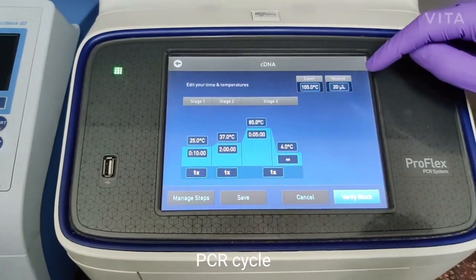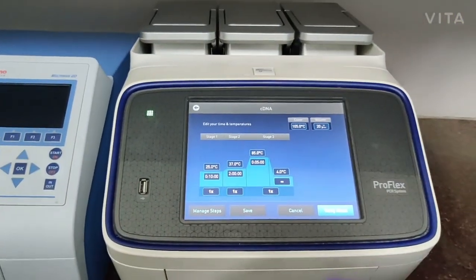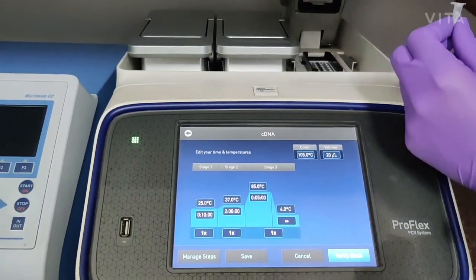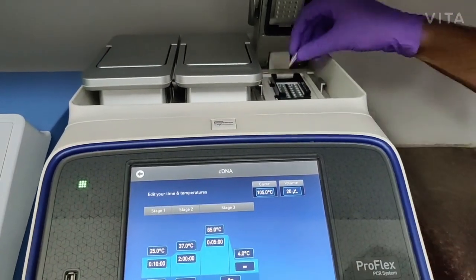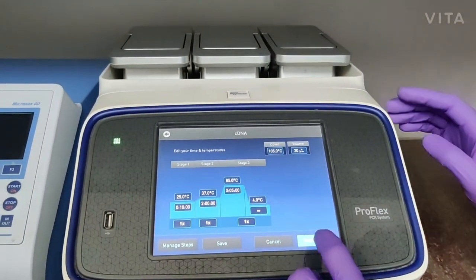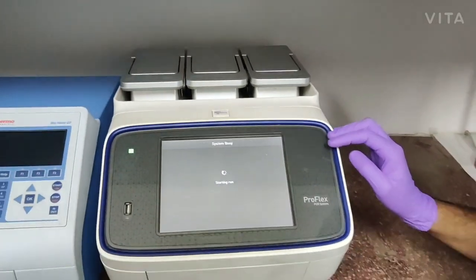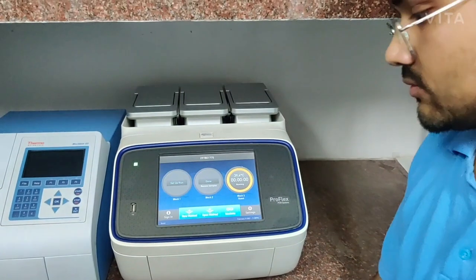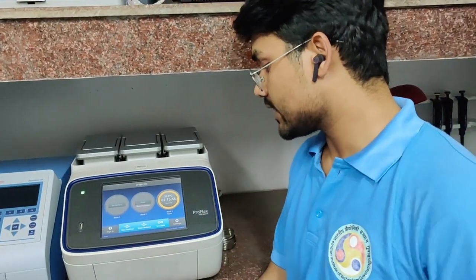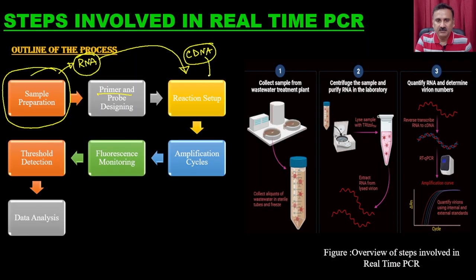You confirm the volume and confirm the steps. You keep the tube in the PCR. Now verify the block and you just start the reaction. Now as you can see, it will take 2 hours and 15 minutes to complete the reaction, and after that our cDNA is prepared.